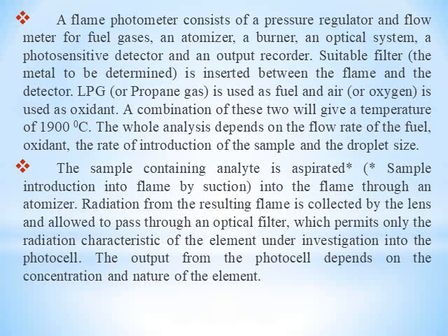The atomizer is a unit that controls the introduction of this salt solution, in the form of spherical droplets, into the flame. With the help of the flame, the liquid metal salt solution converts into vapor form, and it is ionized in the gaseous state.